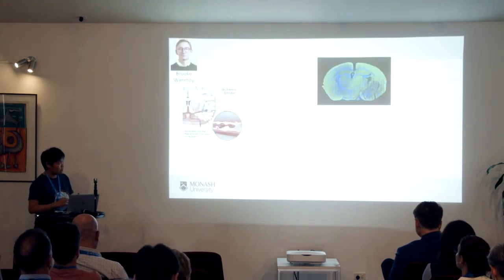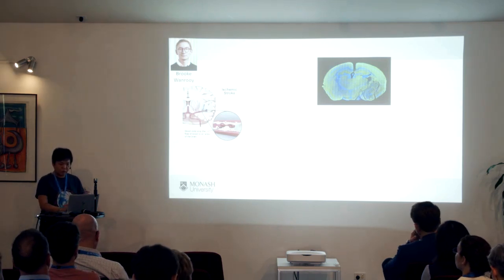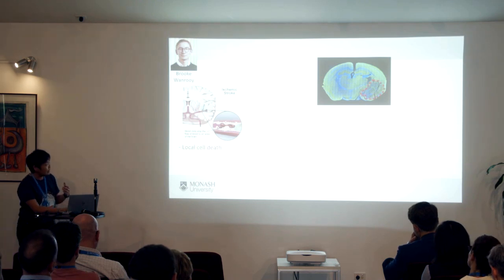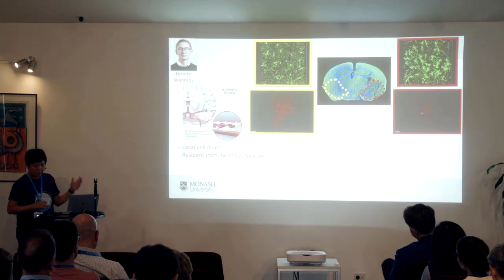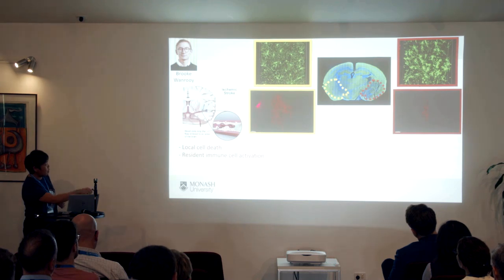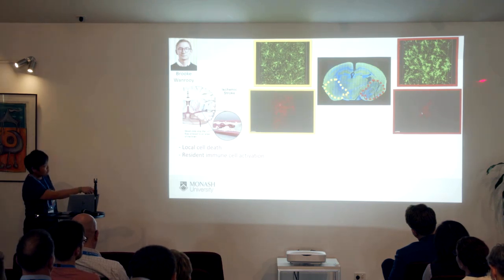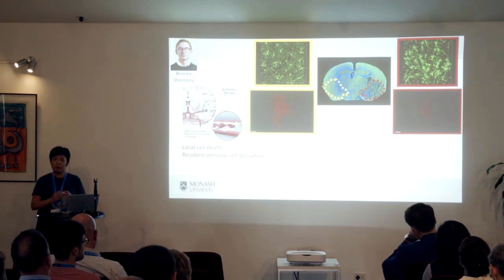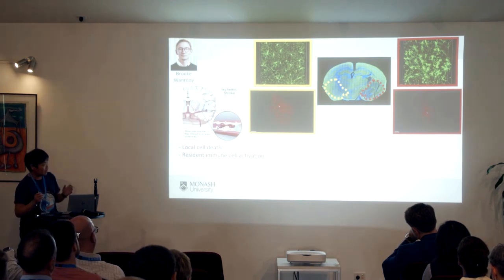But regardless of the model, if you take a closer look at the brain infarct and the area surrounding it, we can see localized activation of microglia. Now, Brooke here noticed that microglia of a non-injured part of the brain are highly dendritic. They have a small cell body. Their dendrites are nice, long, and complex. On the other hand, if you find a microglia close to the infarct area, these cell bodies are huge. They have much less complex dendrites, and they are much shorter.